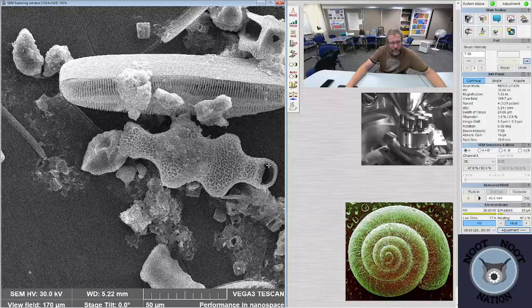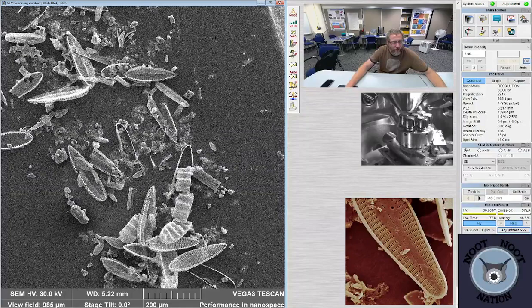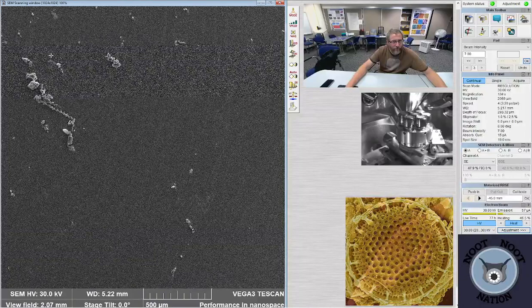The whole end's busted off of that one. Samples are fairly well dissolved for having been collected live. And also, they're dominated by benthic stuff for something that, I think, Pacific Plankton collected with a plankton net. So they must have just washed up from wave energy.